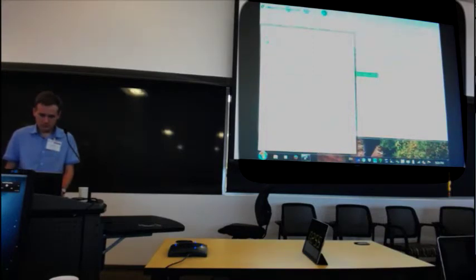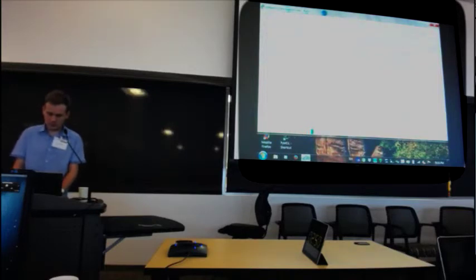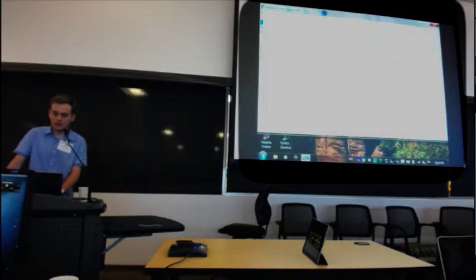Can you show how you use this HKL file? You have to use this script, batch all. It will take all of the individual stream files from these subdirectories and create one big stream file.